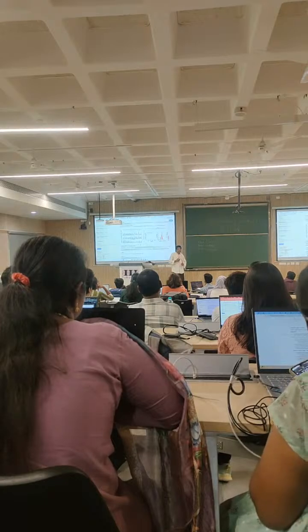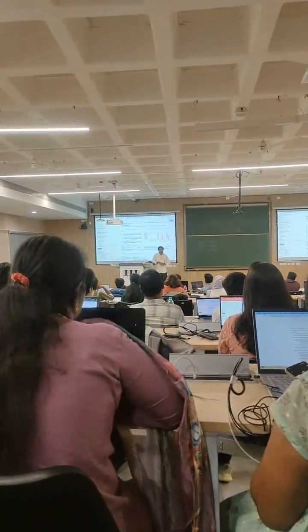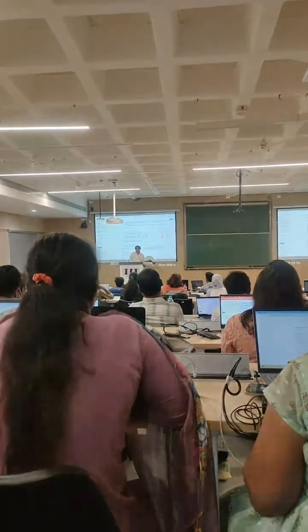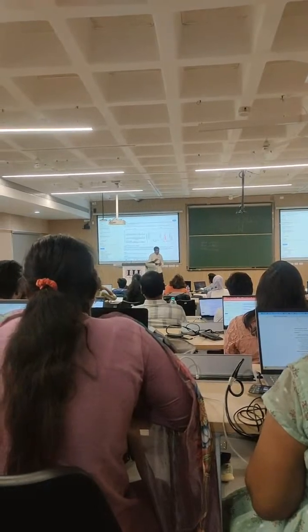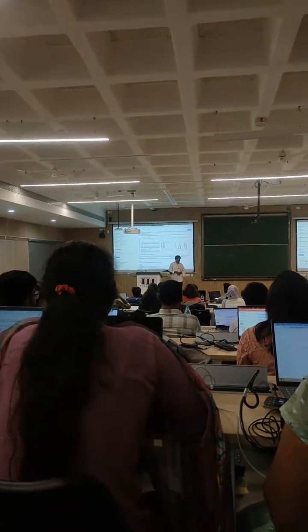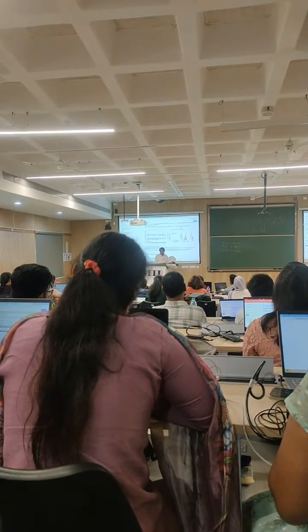After that, we need to directly go with the PCR analysis to check whether the edit is there or not, comparing with the respective primers first. Then second, sequencing. The sequencing results we need to compare with the respective primers for the respective base addition or deletion. Indel mutations, we need to check for the indel mutations. Then we go with the respective trait analysis.